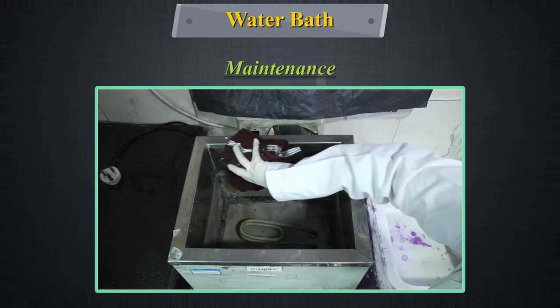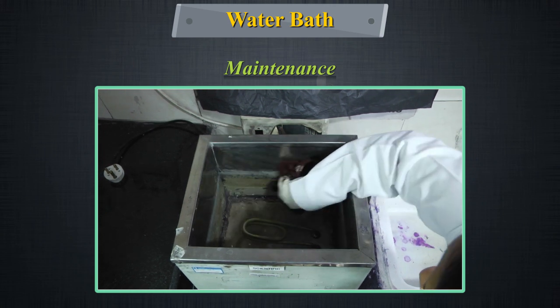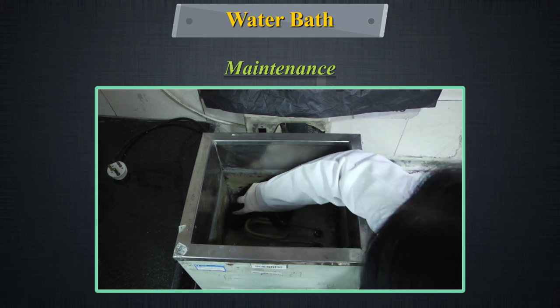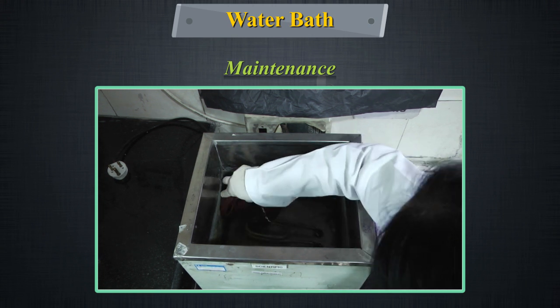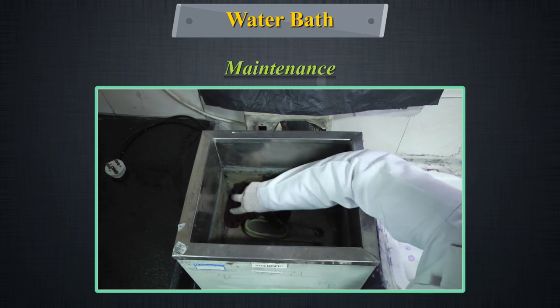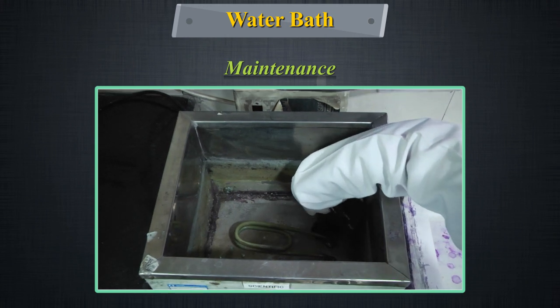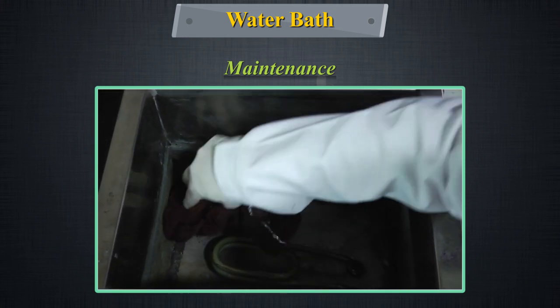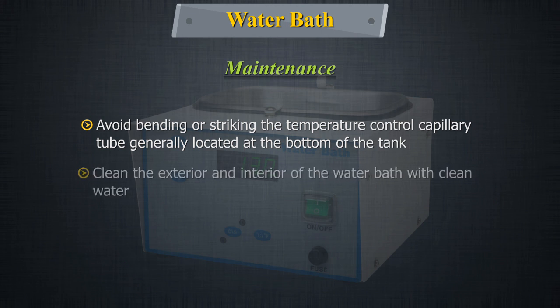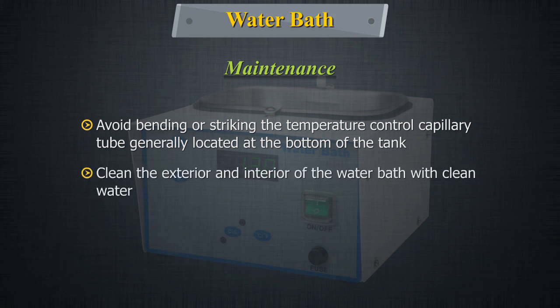If there is any indication of corrosion, use substances for cleaning stainless steel. Rub lightly with synthetic sponges or equivalent. Avoid using steel wool to remove rust stains as these leave particles of steel which could accelerate corrosion. Avoid bending or striking the temperature control capillary tube generally located at the bottom of the tank. Clean the exterior and interior of the water bath with clean water.